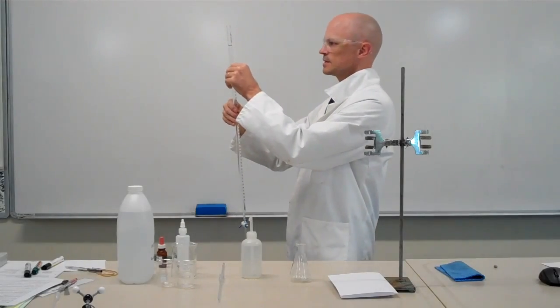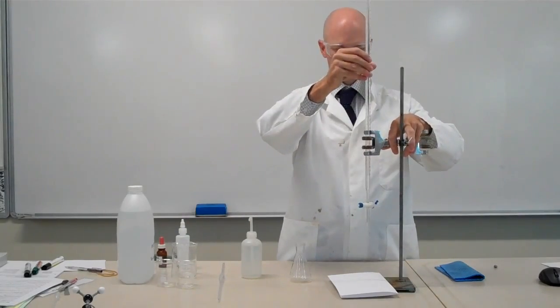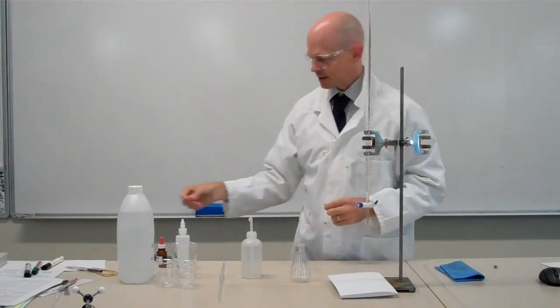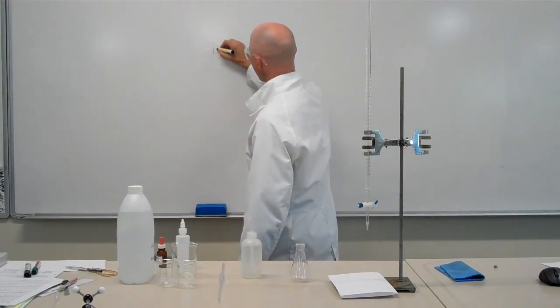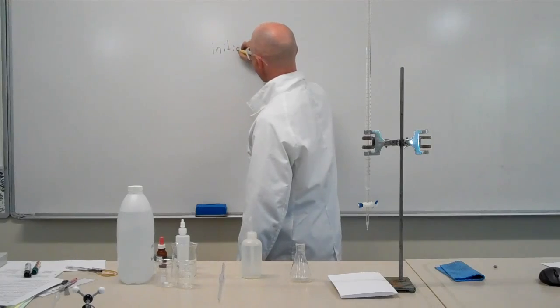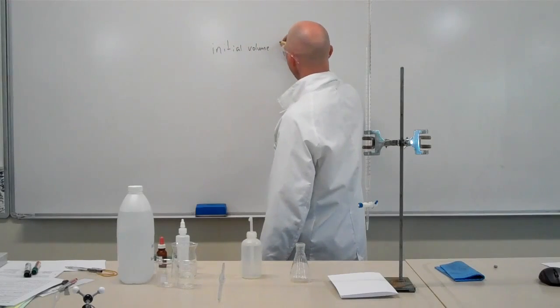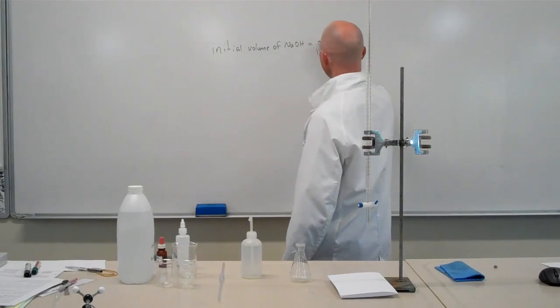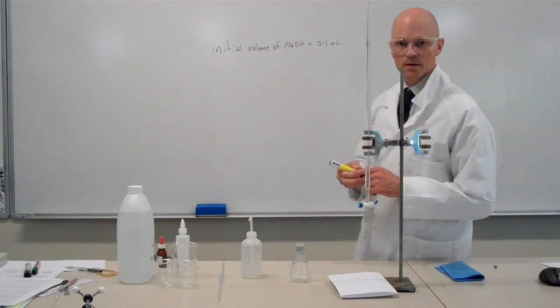I'm going to read it, read the scale here, it's 0.1 ml. I'll pop that in my burette clamp. So my initial volume is 0.1 ml.